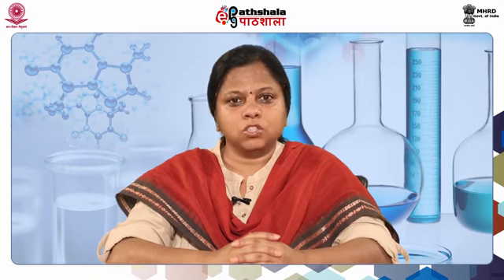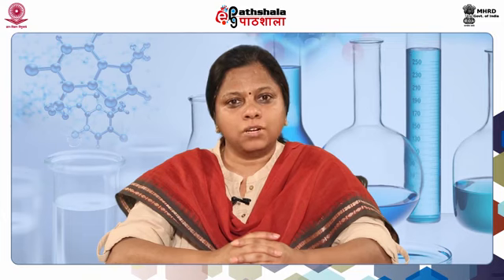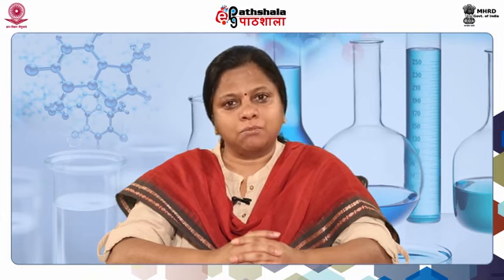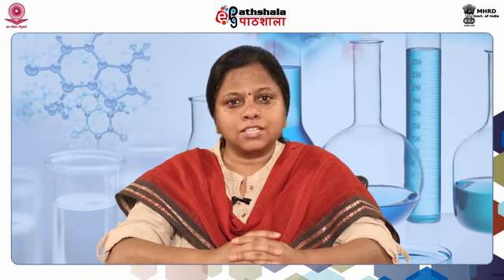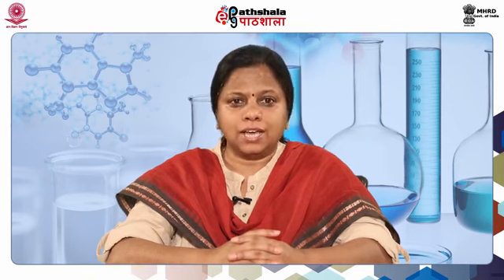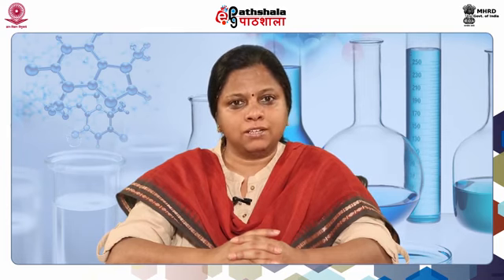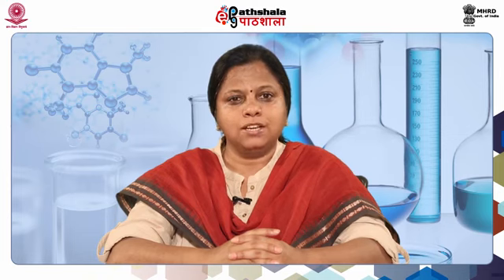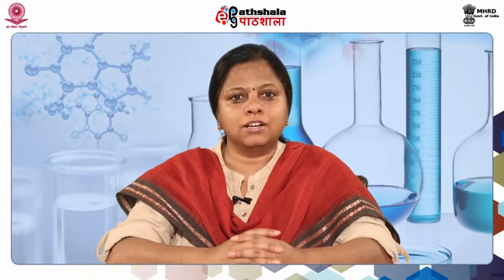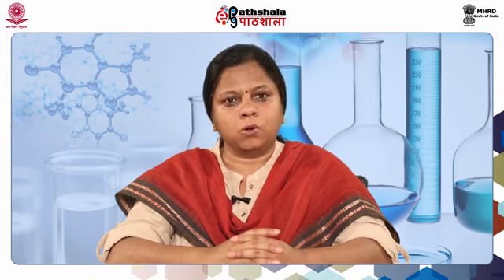In this module, you will learn about macromolecular blotting, or more commonly known as hybridization, its types and its applications. This technique is used for the detection of pathogens from plants, humans and animals. Besides this, it also helps to determine the molecular weight of the proteins, and in this module you will learn methods of blotting and what are the variations and similarities in three types of blotting.